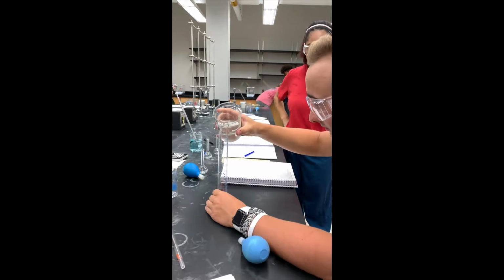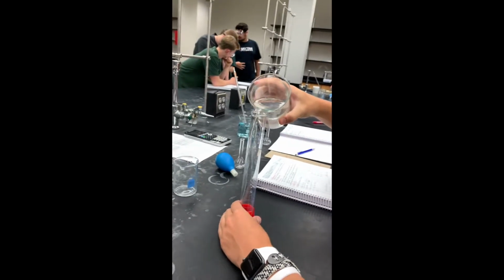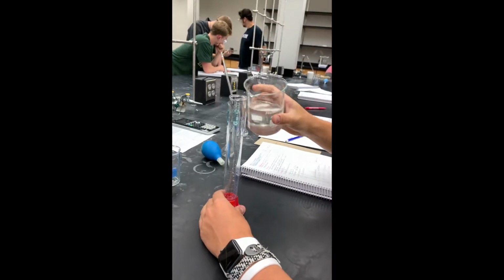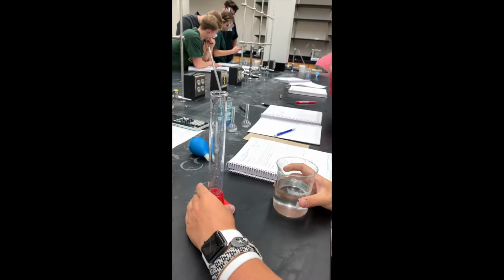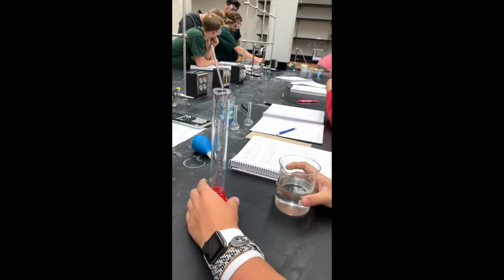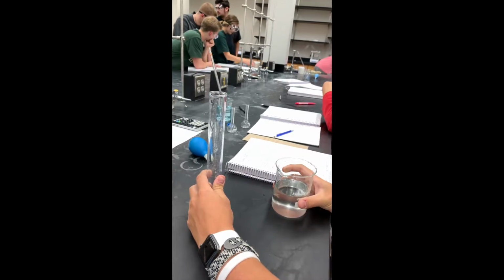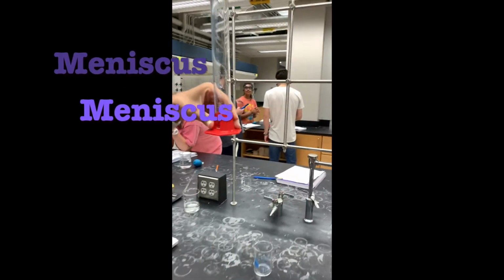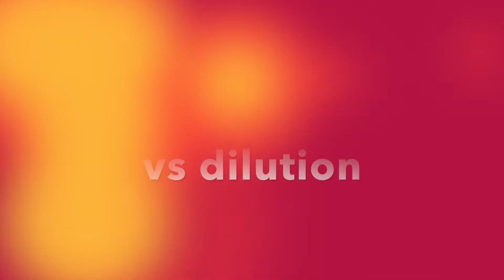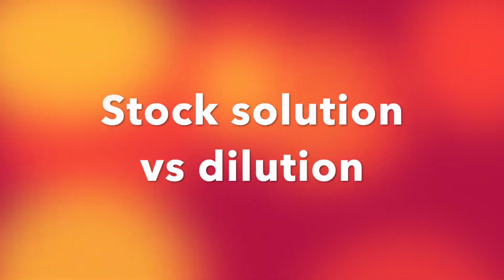When noting the volume through either a graduated pipette or a graduated cylinder, you must read it at the meniscus. The meniscus is a curve formed on the upper surface of a liquid inside of a container. This curve is formed by the surface tension between the liquid and the container holding the liquid. The way you read the meniscus is by holding the graduated cylinder or the graduated pipette at eye level and noting the measurement.